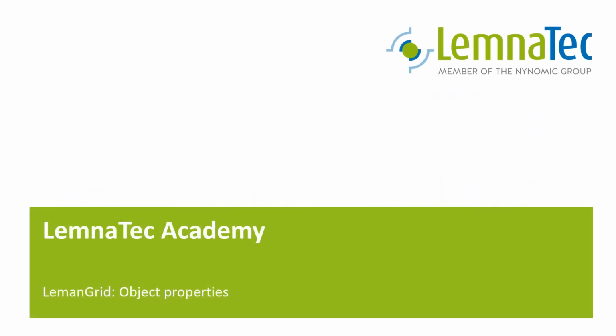In this video, I will explain the software architecture of the software used by the LemnaTec systems and devices as of the 2022 generation.